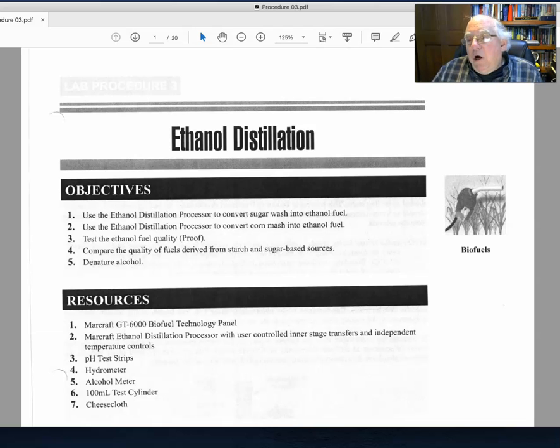In the previous procedure one, we saw where we could make a mash using cornmeal to make a solution that we could then add catalyst to and then add yeast to in order to begin the process of the sugars being turned into ethanol.